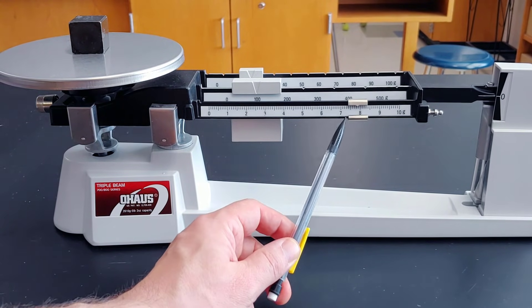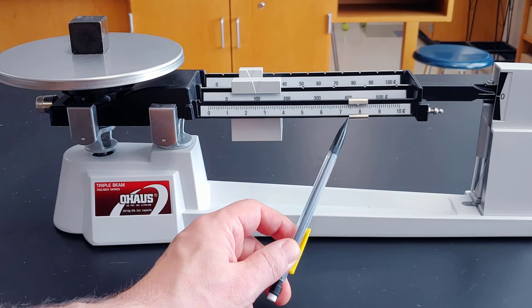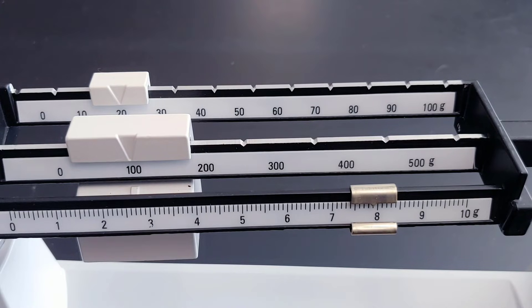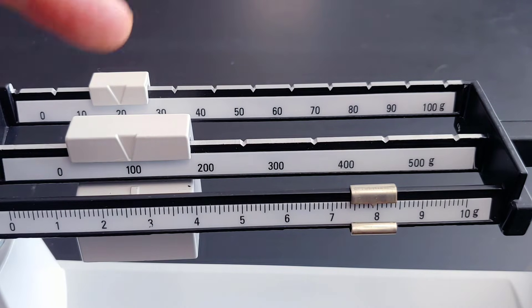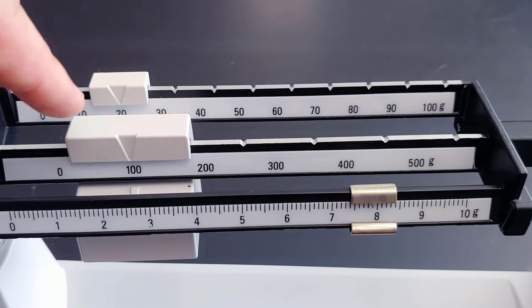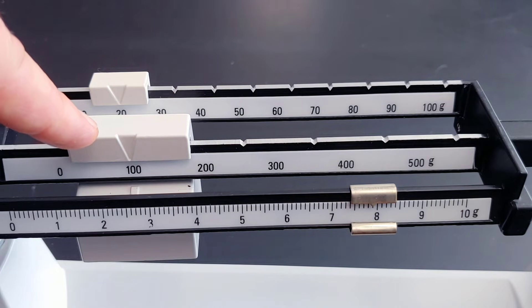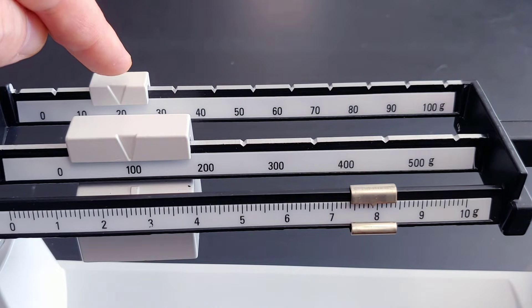Now let's zoom in and see what number we have. To find the mass, we need to add up each of the arms. This arm's at 100, so we have 120.